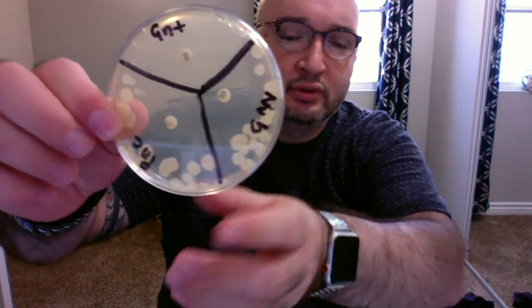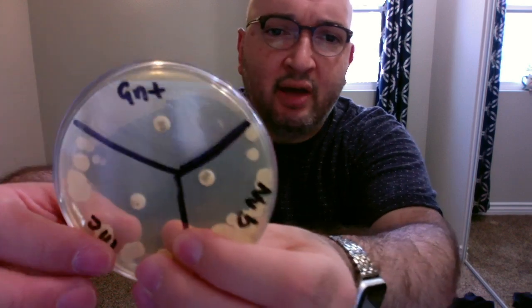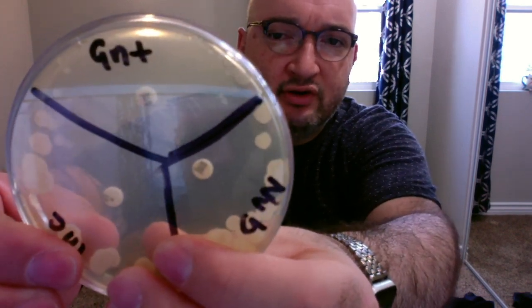As you can see, there is growth of the microbe Staphylococcus epidermidis throughout the novobiocin and then the penicillin, and then in very minor amounts in the gentamicin portion.